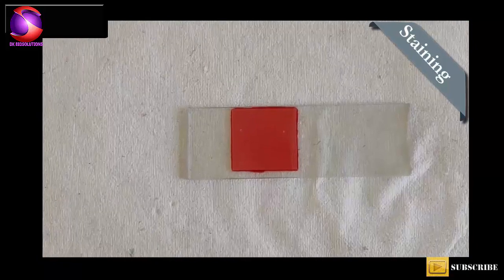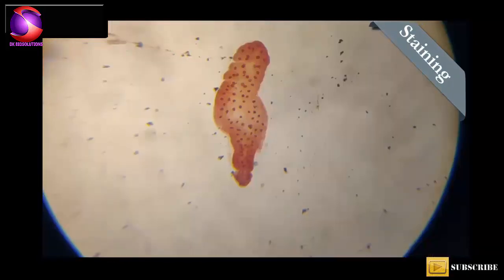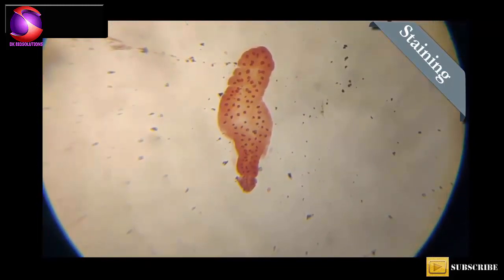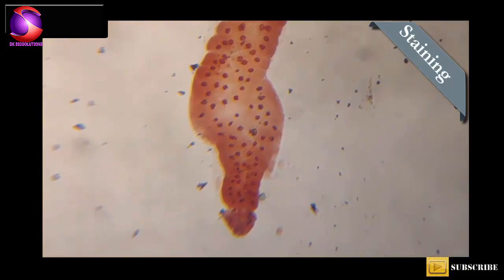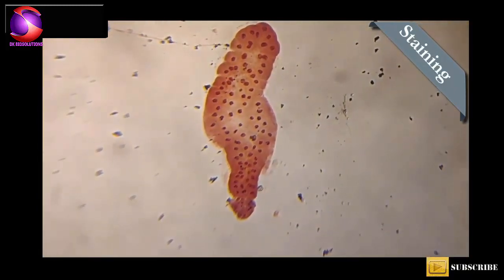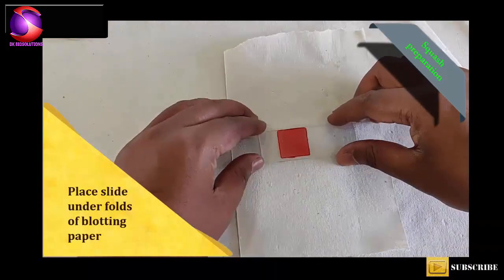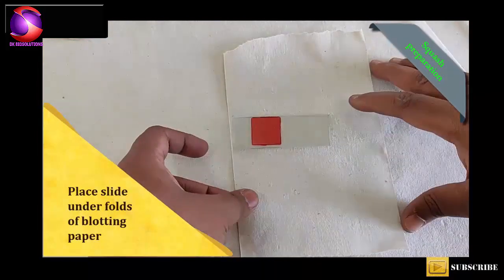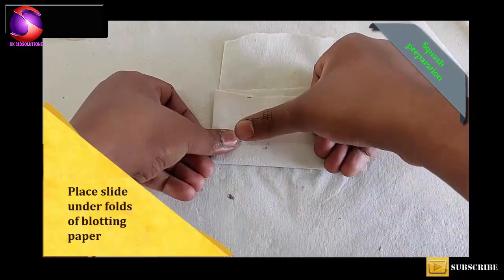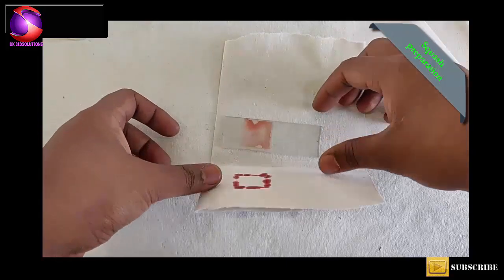Before squashing the salivary glands under the cover slip, you can observe these under the microscope. You will see nicely stained salivary glands under the microscope. To squash the salivary glands, place the slide in between layers of paper and apply pressure with your thumb.